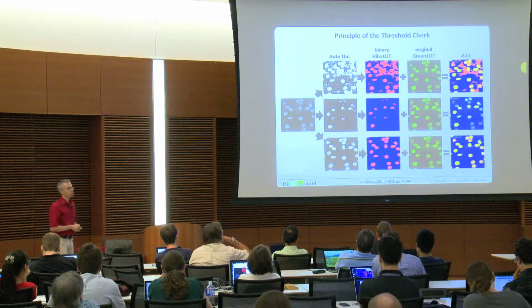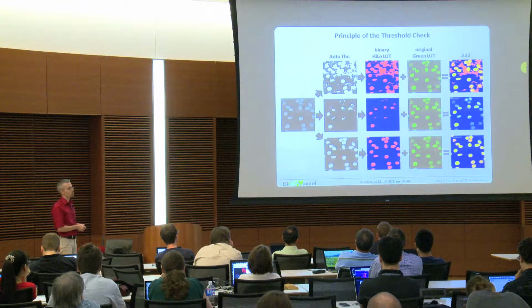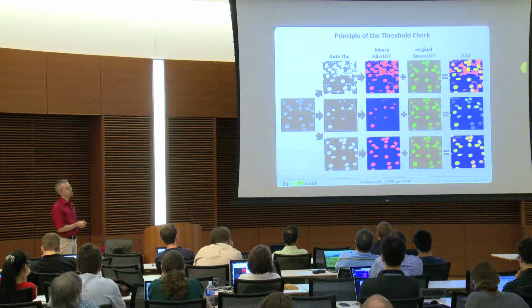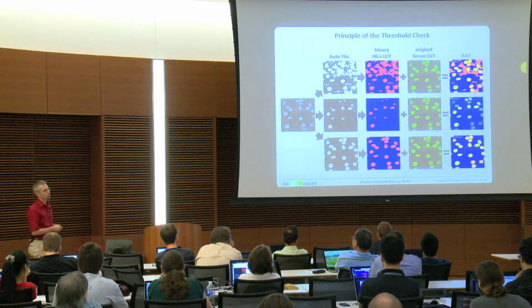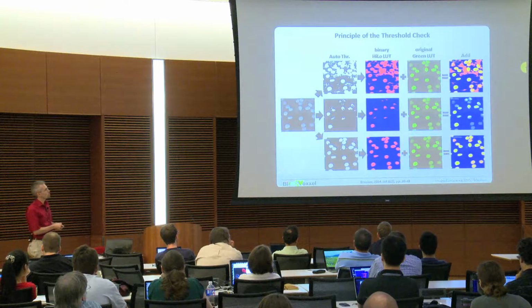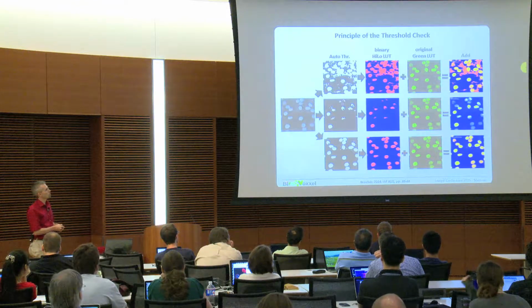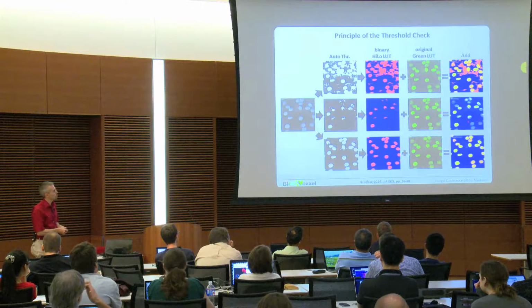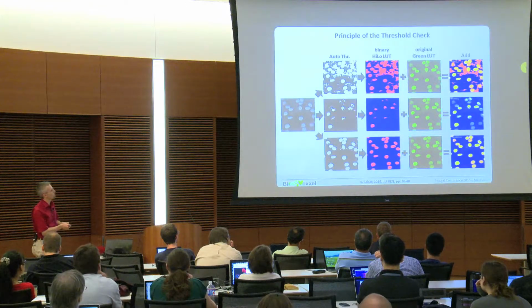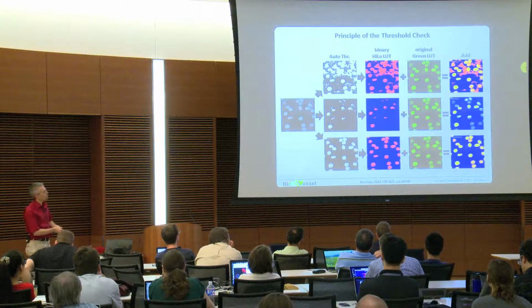How is that working? That works very simple. It uses existing methods. It simply takes the original thresholds, all the 16 methods, then applies this high-low LUT already mentioned, where white pixels are red and black pixels are blue. Then it takes the original and applies a green lookup table, and then simply combines these two images, and green and red gives you yellow, and black and red would give you here, the green and the blue would give you this cyan. So basically that is how these are created.